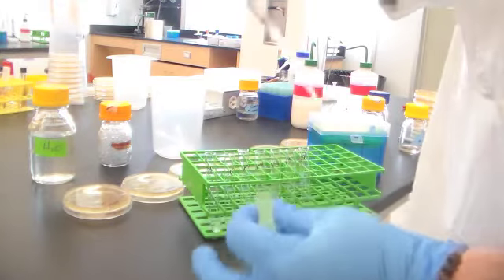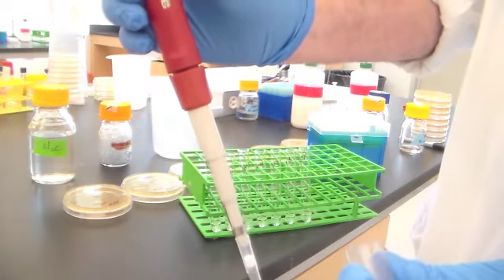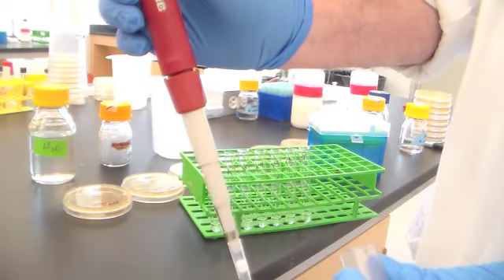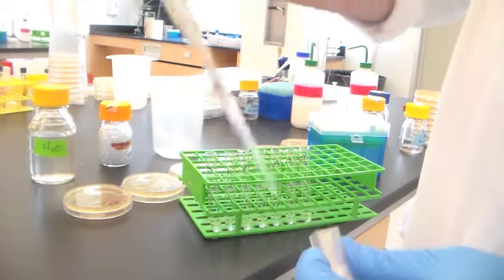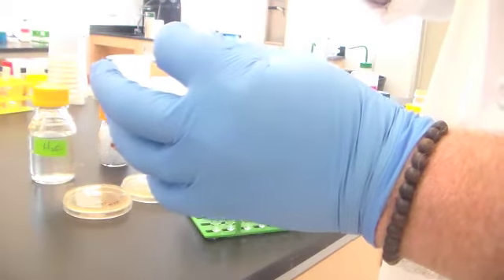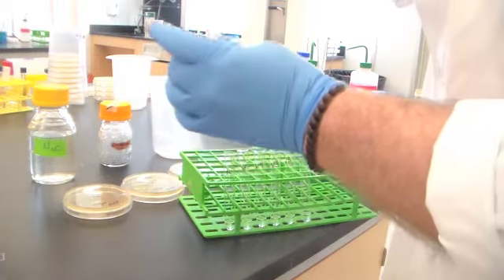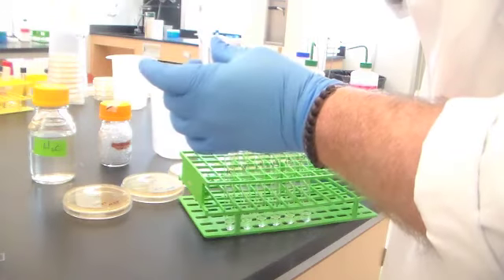So what I'm going to do is I've now set the pipette to 1/10 of 1 mil, or 100 microliters. So I'm going to go down again, first stop, I'm going into that cuvette. I'm pulling up now 100 microliters, and I'm going to put that 100 microliters into this first tube.